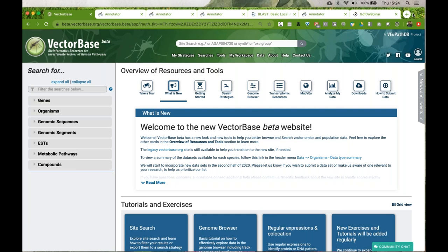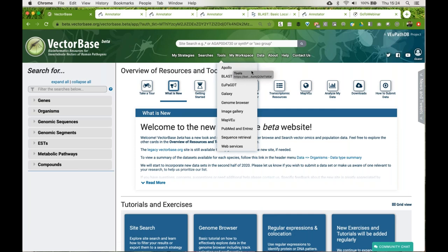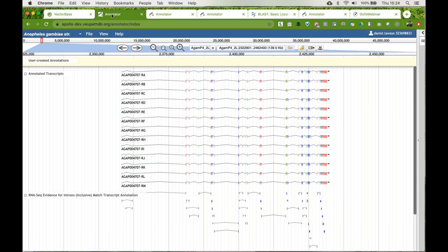Now going to a web browser: this is the home page for the beta release of VectorBase, not quite out yet. Access to Apollo will be via this tools menu — it's the first option in the drop-down menu that says Apollo. That will take you to a page that looks like JBrowse, because it essentially is JBrowse — it's a plugin.